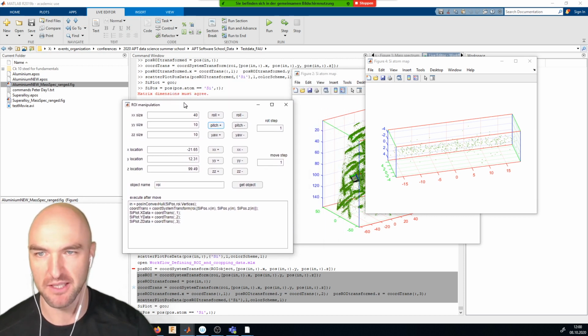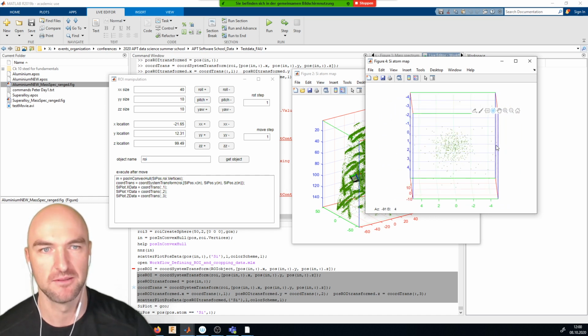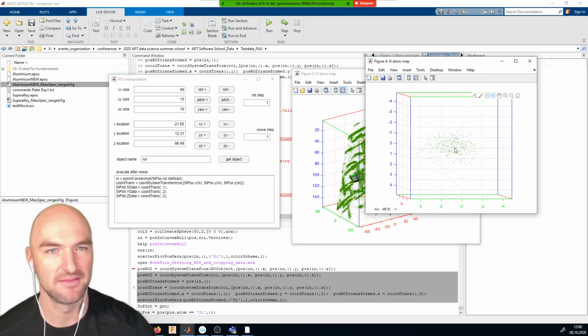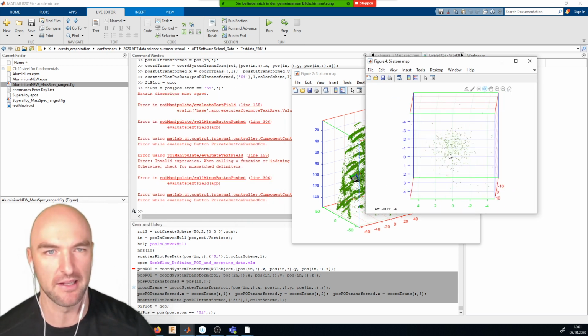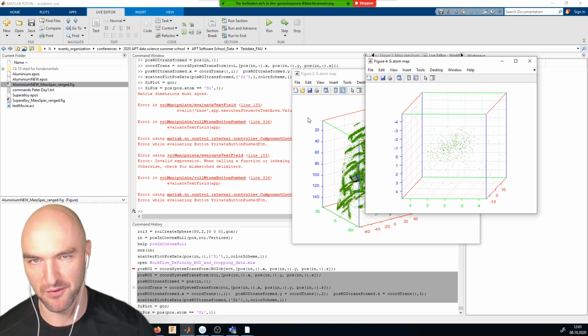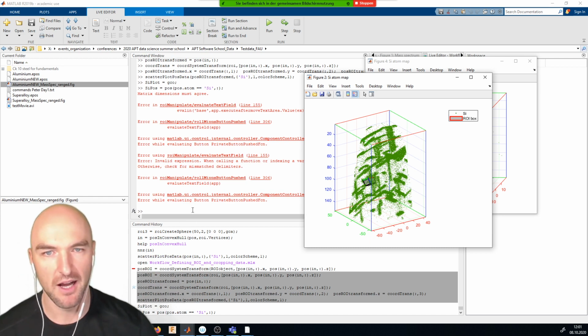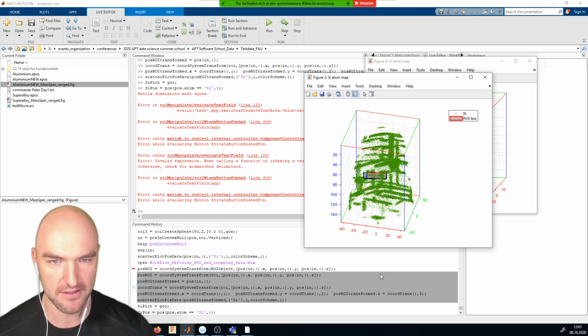I will just close the Manipulate ROI app, just simply because we have aligned it to the ROI. Oh, no, you know what? I'll just minimize it. Maybe we'll need it later. But if you want to realign the ROI and you've closed the app, you can reopen the app very easily and then just say, okay, I want to work on this ROI now and move it around. And to do that, what we need to do is we need to calculate distances, right? So we need to calculate distances to create an analysis.